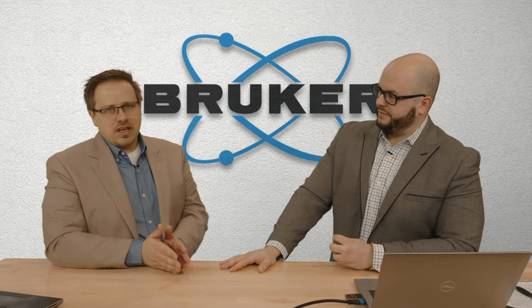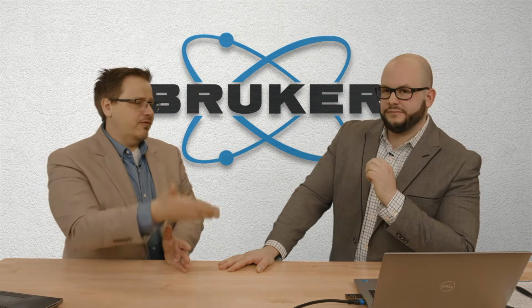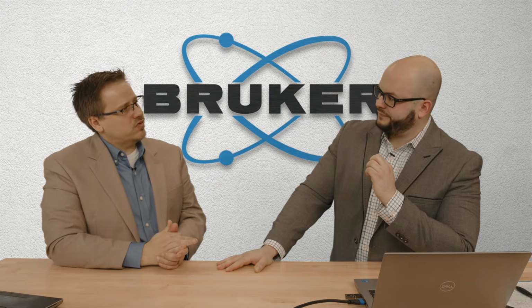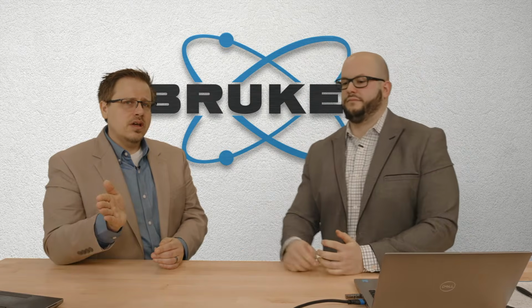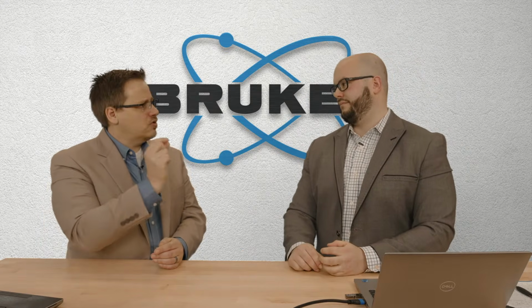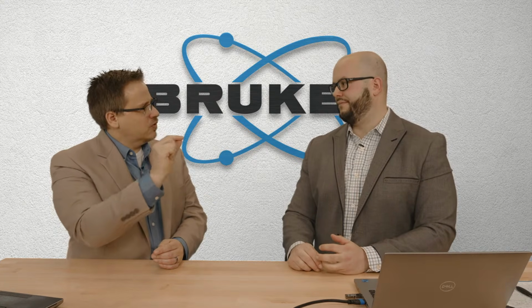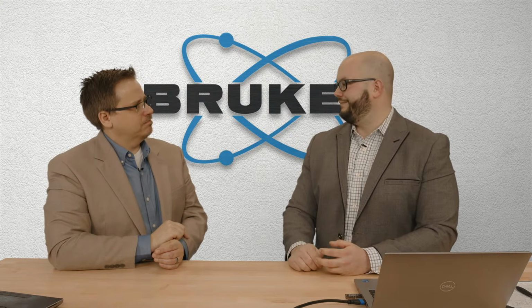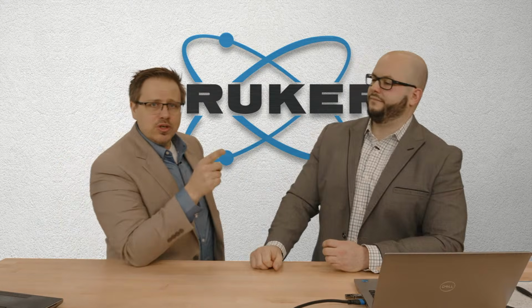So in terms of what you have to do to get the result out, unfortunately, we don't take a change of temperature into account with the software. So you'd have to go back to the sine squared psi equation. And when you calculate your strain, so strain is delta D over D, you have to use the right Ds.